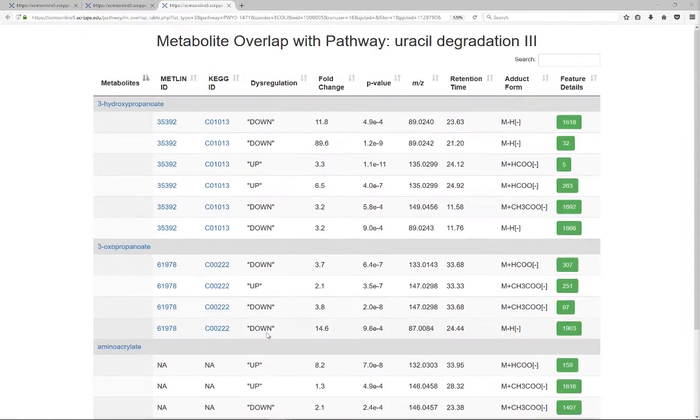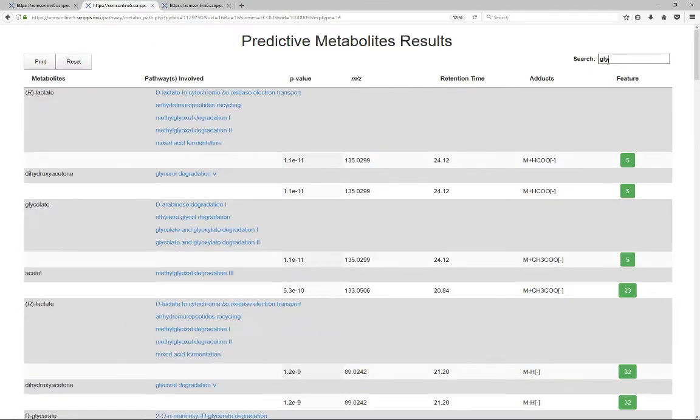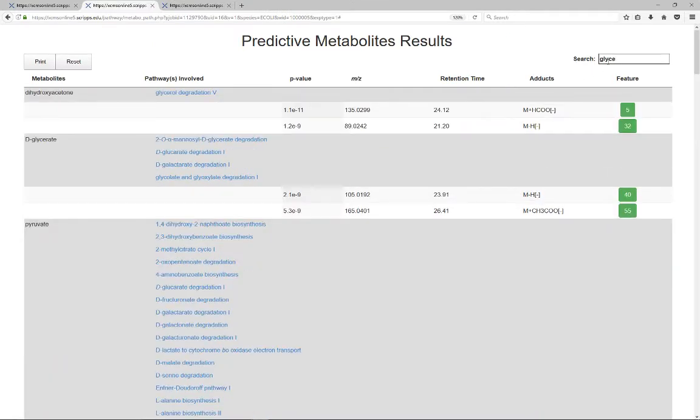Users can also type in the metabolite name in the search bar on the top right of the page to get information for a particular metabolite.